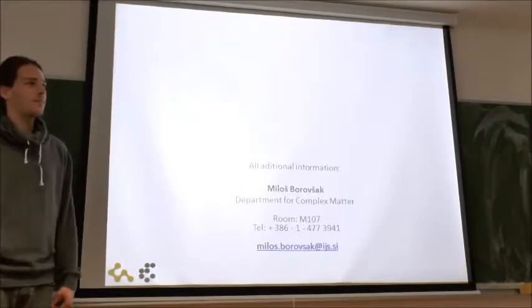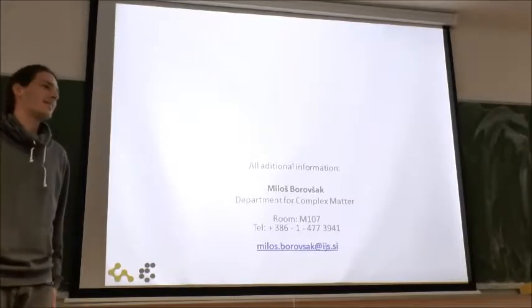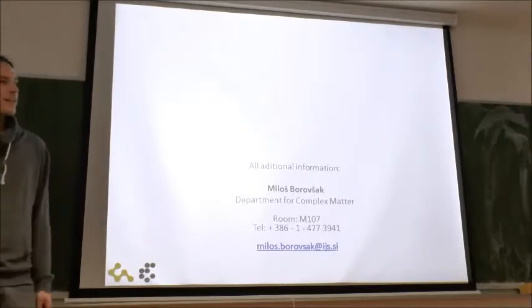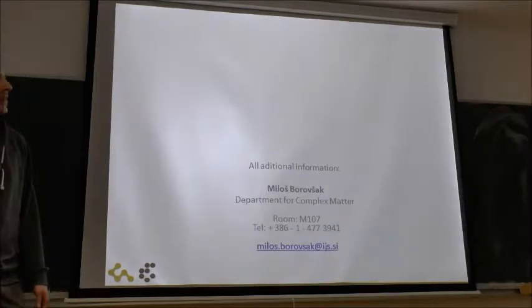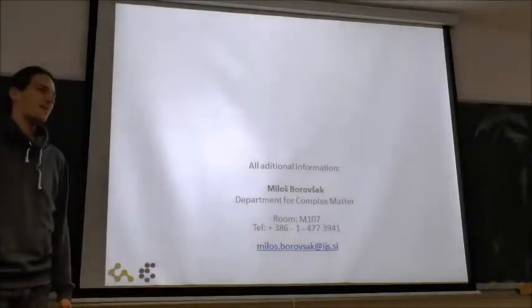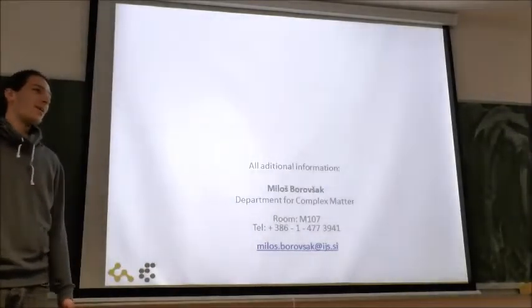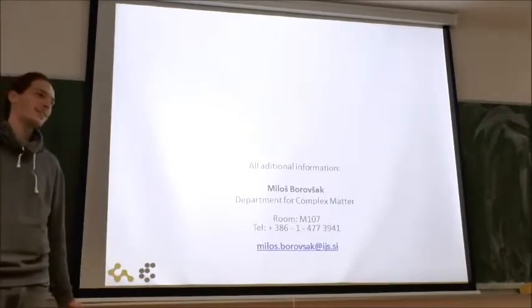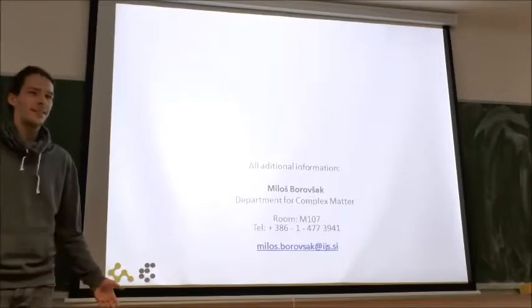Are they expensive? Yes, they are expensive. Can you make them? Well, you can make these STM tips for the tip-enhanced, but the AFM tips, I don't know that someone will produce them. We have the focused ion beam here at the institute, so probably we can do this, but it will take a lot of time.